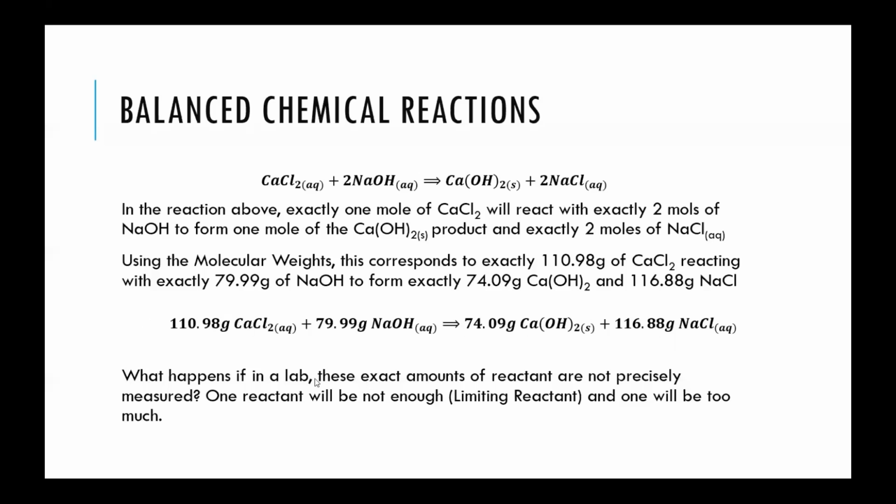So in labs, one of these is going to be limiting based on the actual amounts that you weigh out. And in these reactions, the limiting reagent or the limiting reactant is what is controlling the entire chemical reaction. Because whatever excess material might be there is not going to be involved in the reaction. Only what can react with the limiting reactant is what will generate the product.